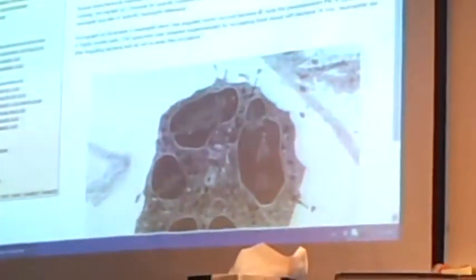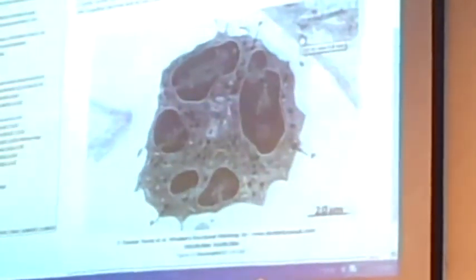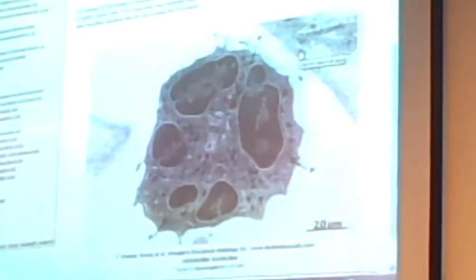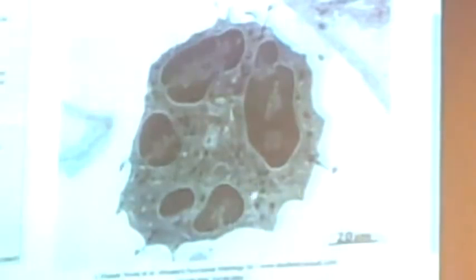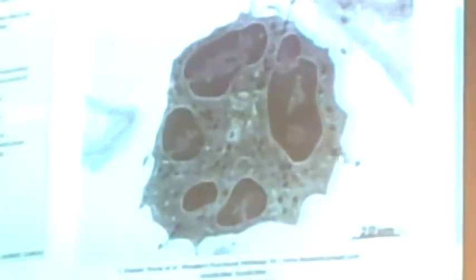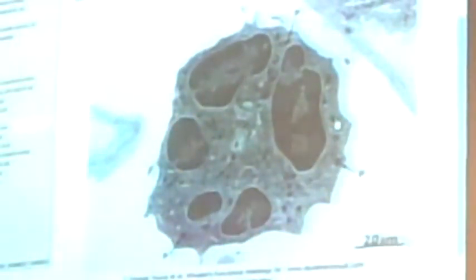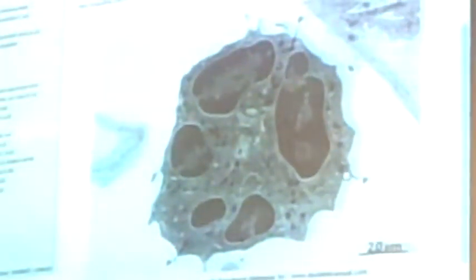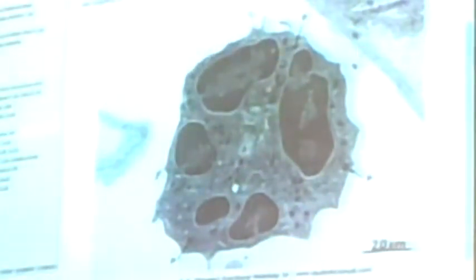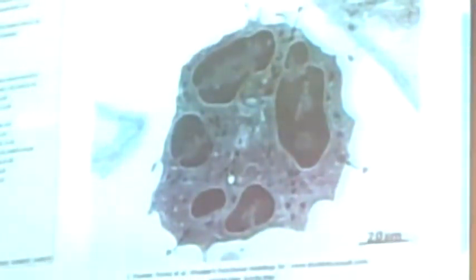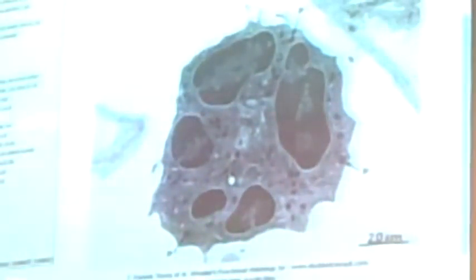In this neutrophil electron microscopic section, you can see five lobules of the nucleus. You can see dense structures - the big ones are the primary granules, the small ones are the secondary granules, and tertiary granules are further smaller. So the biggest are primary, then secondary, then tertiary.